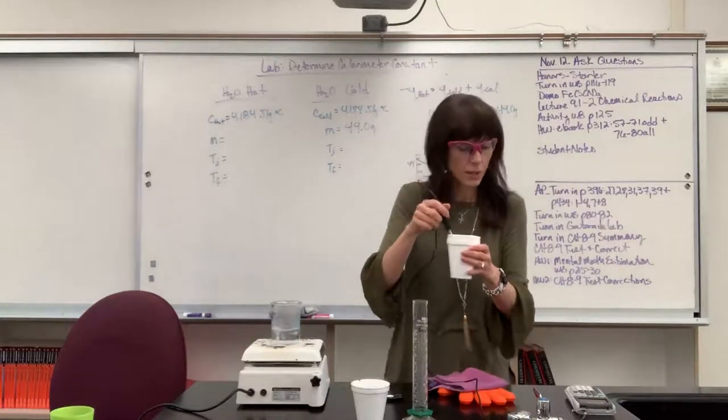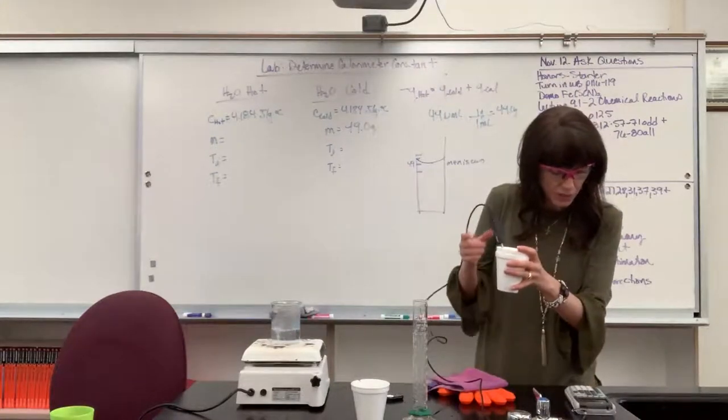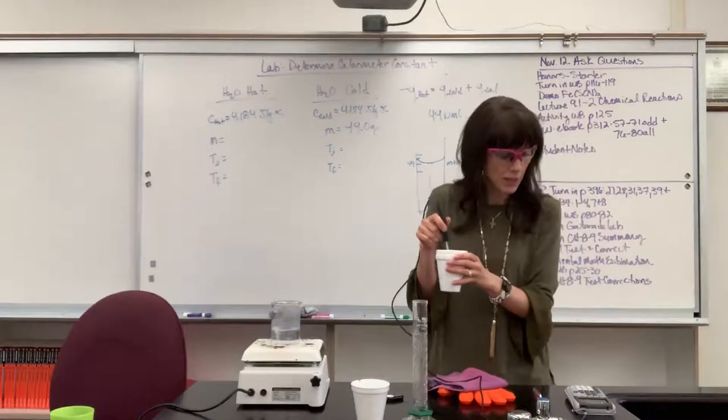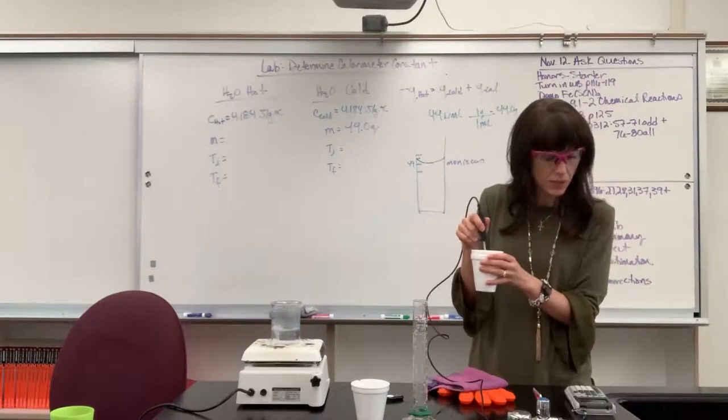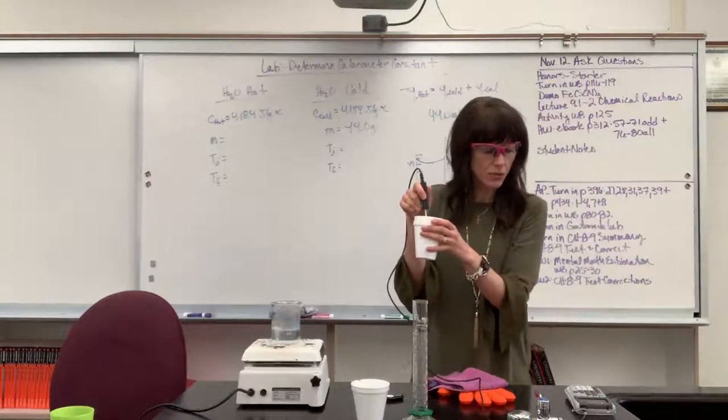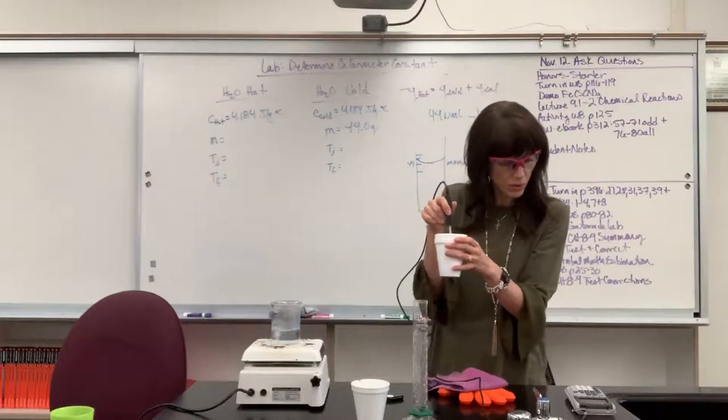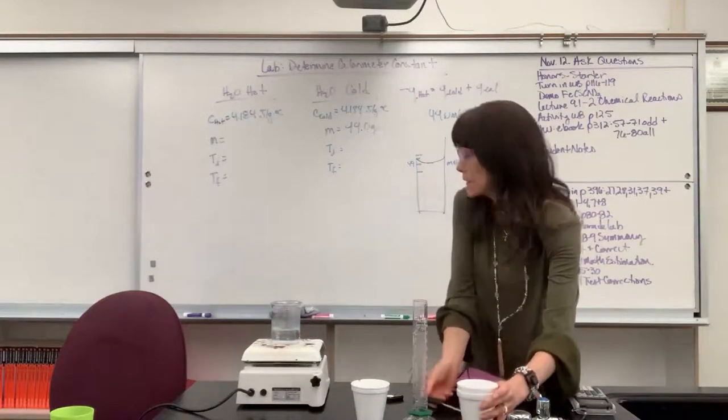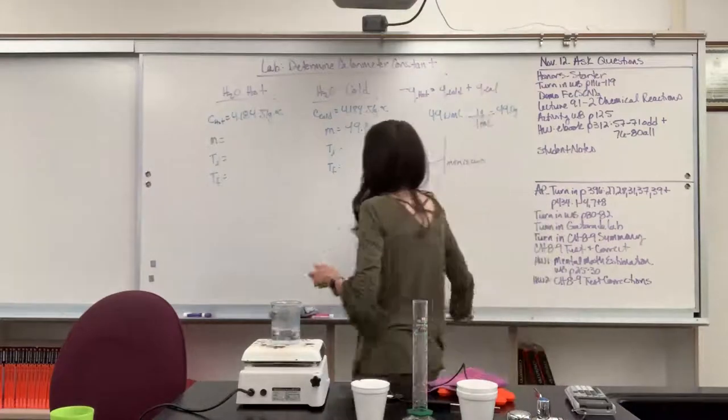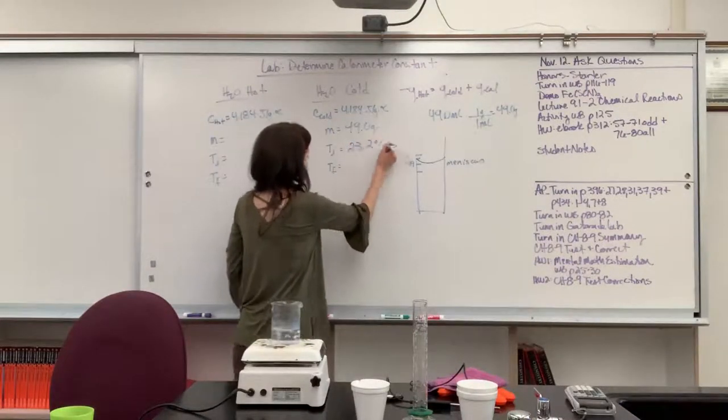And then I'm going to stir it. Oh, and do you like my temperature probe? Let's make sure I can read it here. Make sure that it's stable, that it's not moving. Okay, it's holding. So the temperature of the water and the cup. So the cup and the water are in thermal equilibrium, and it's stable. It's 23.2 degrees C. Let's write that down. So the initial temperature of my cold water, 23.2 degrees C.